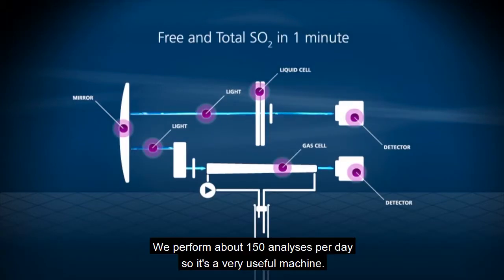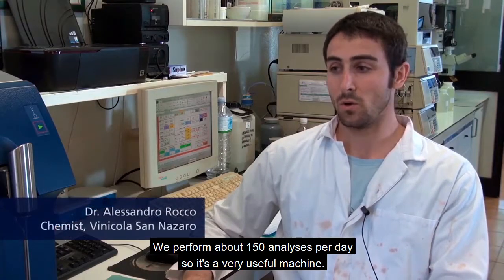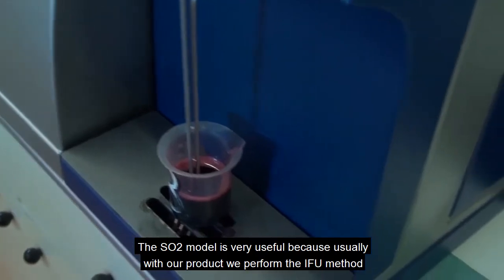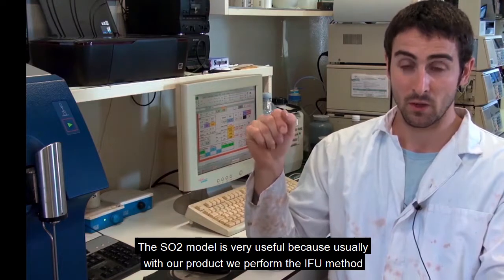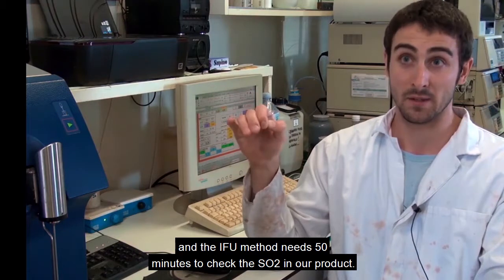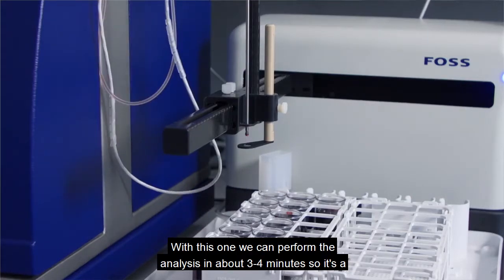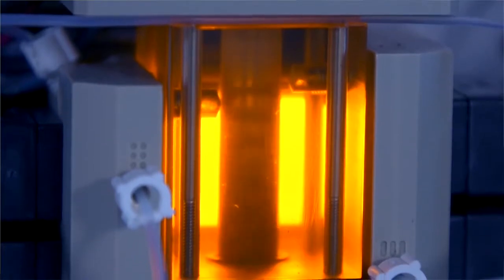We perform about 150 analyses per day, so it's a very useful machine. The SO2 module is very useful because usually, with our product, we perform the IFU method, and the IFU method needs 50 minutes to check the SO2 in our product. With this one, we can perform the analysis in about 3-4 minutes, so it's a big advantage.